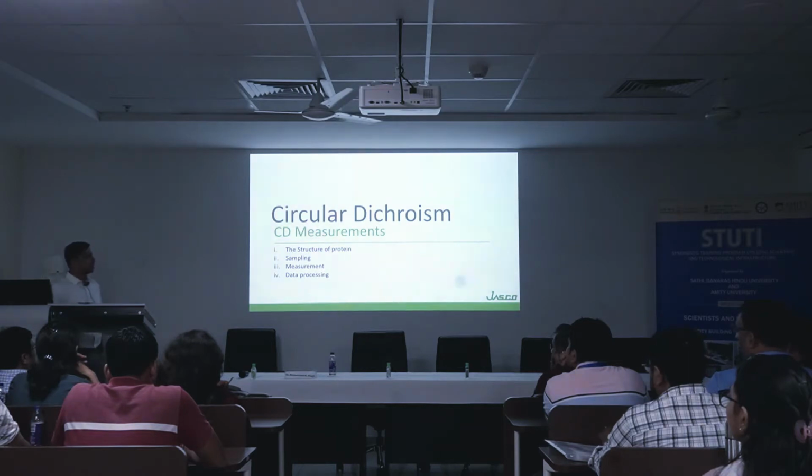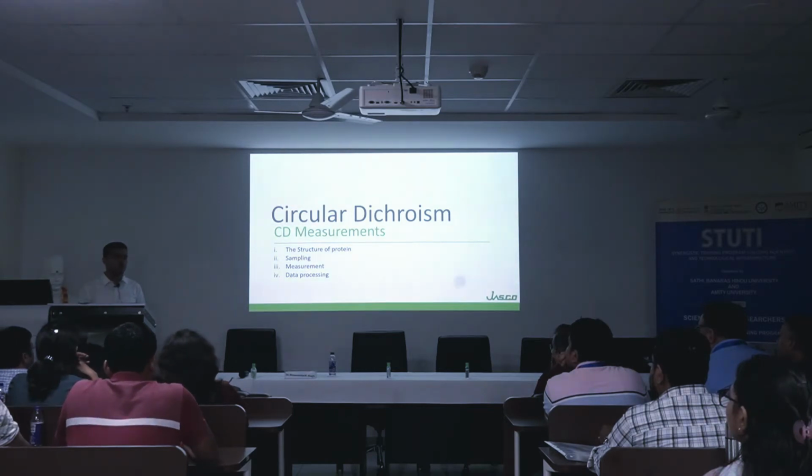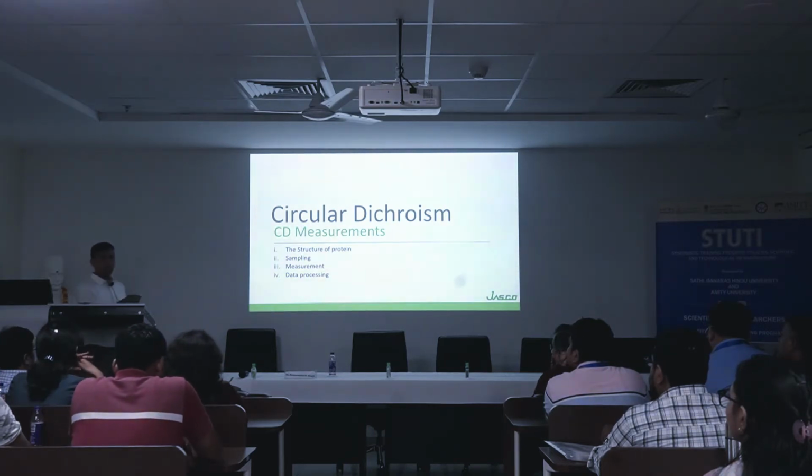My point in taking this session is to help you know your samples very well before you go to the analysis. Whenever we go to the instrumentation lab, the CD lab, there are different things to consider. What kind of samples are you going to analyze? What should be the source of your samples? What is the purity of your samples? What are the pre-sampling methods required to get the samples analyzed? Then, what are the different measurement techniques?